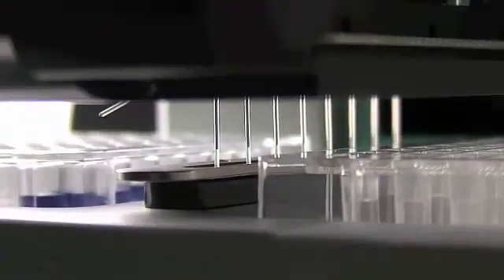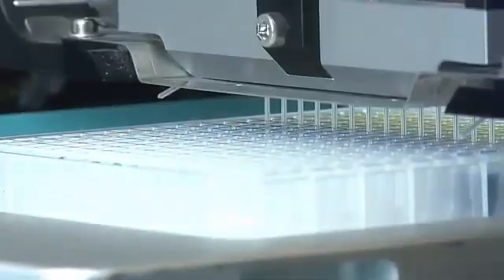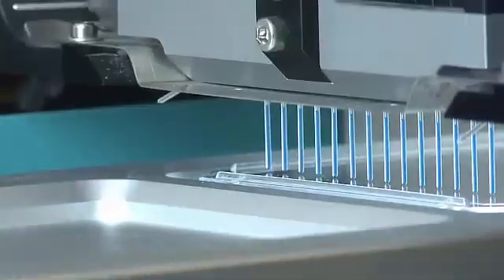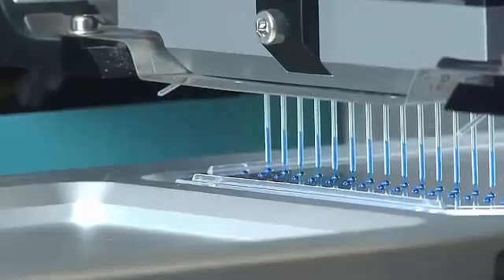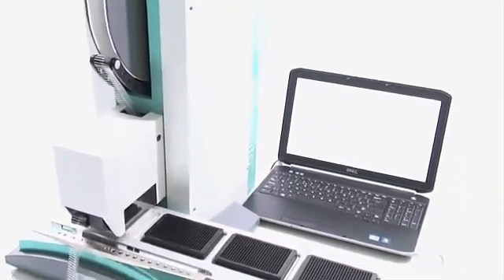This is completely unique for an automated pipetting system, and it means that there is no system liquid and no air gap between the piston that is moving the liquid and the liquid itself. This gives us unrivalled pipetting accuracy and repeatability, particularly at low nanolitre volumes, compared to any other system across a huge range of viscosities and surface tension liquids. Mosquito is a really reliable instrument — it is extremely fast and extremely user friendly, and that's what our users really love about it.